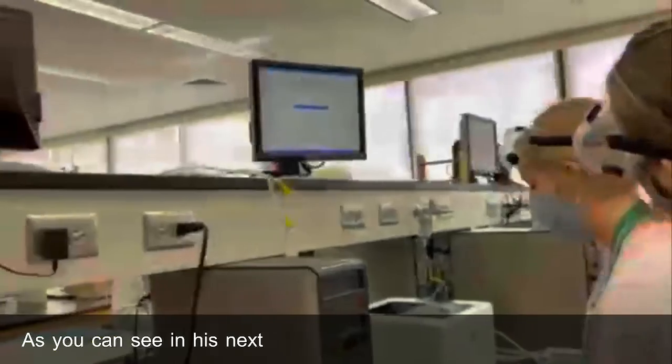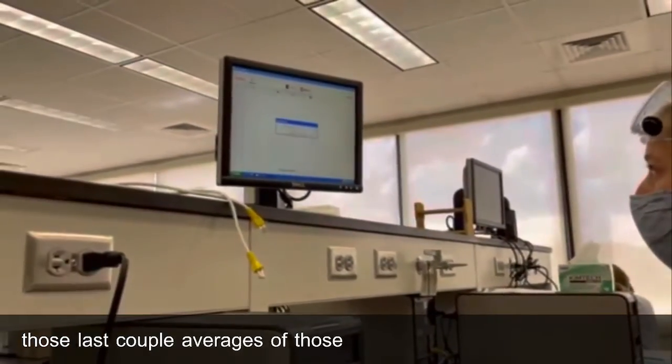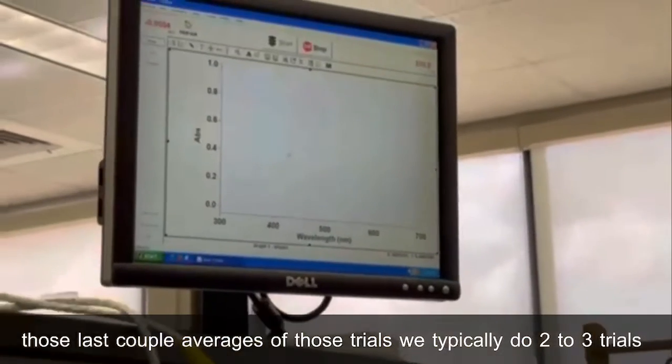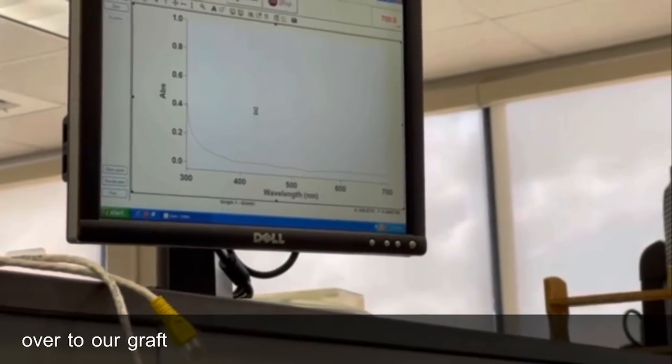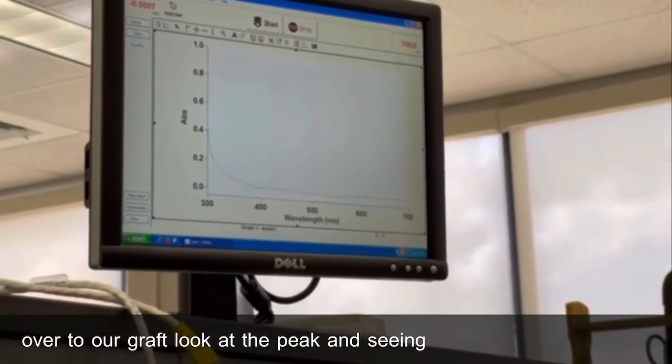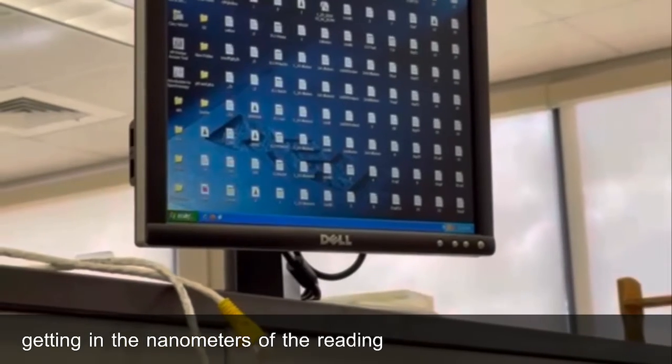As you can see in this next clip, we are just finishing up writing down those last couple of averages of those trials. We typically do 2 to 3 trials per solution. And what we're doing here is flipping over to our graph to look at the peak and seeing the results that we're getting in nanometers for that reading.